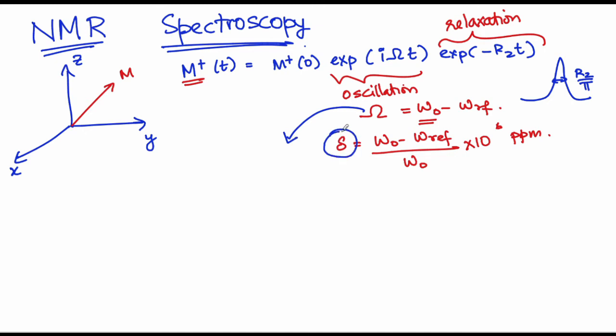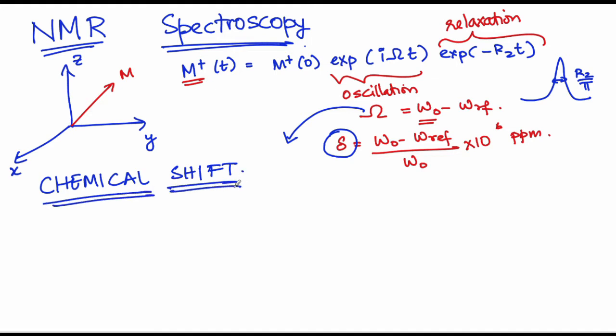For most spectroscopists, we are quite familiar with the term absorption wavelength or absorption frequency. You can imagine chemical shift to be a similar parameter, however, it is loaded with more information than what you generally get in an absorption or an emission signal.